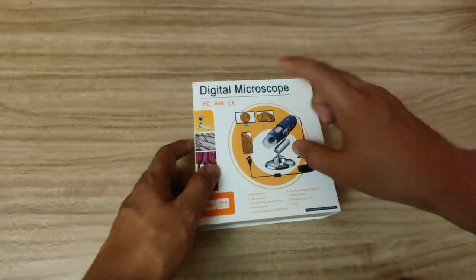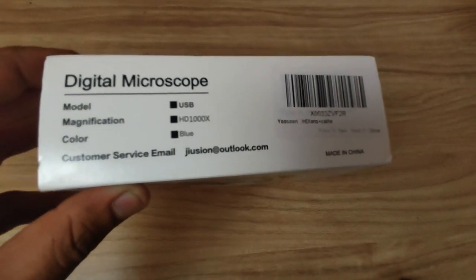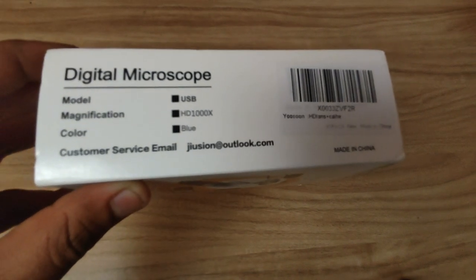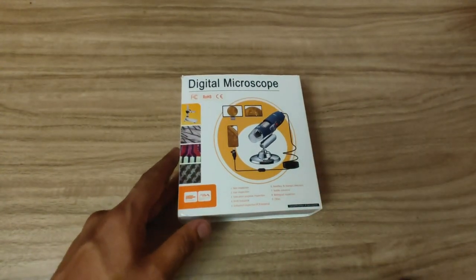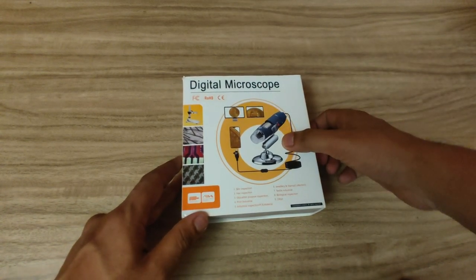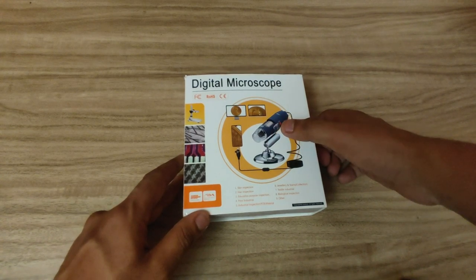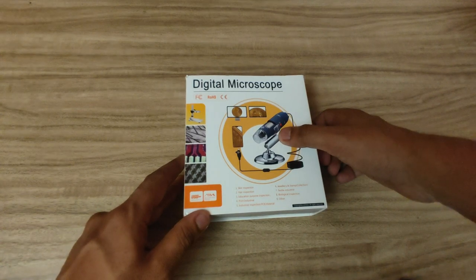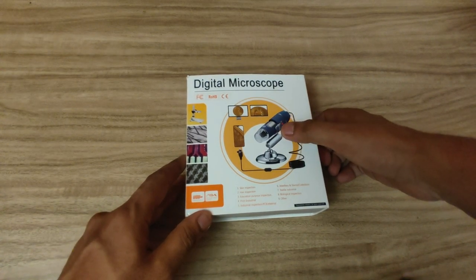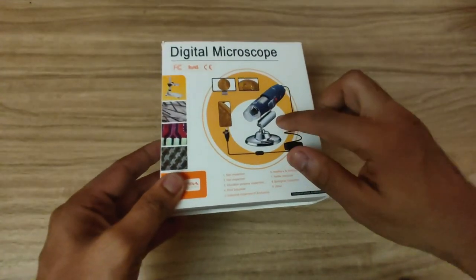For this video I'm going to use this digital microscope. I'm not sure about the name, but if you see the customer service email it is something like jilson at outlook.com, so I guess that's the name of the company. I bought it from Amazon and I'll give you the Amazon link. I went through different products and microscopes on Amazon and found that this one has really good reviews, so that's why I went with this one. But any USB digital microscope should work fine.